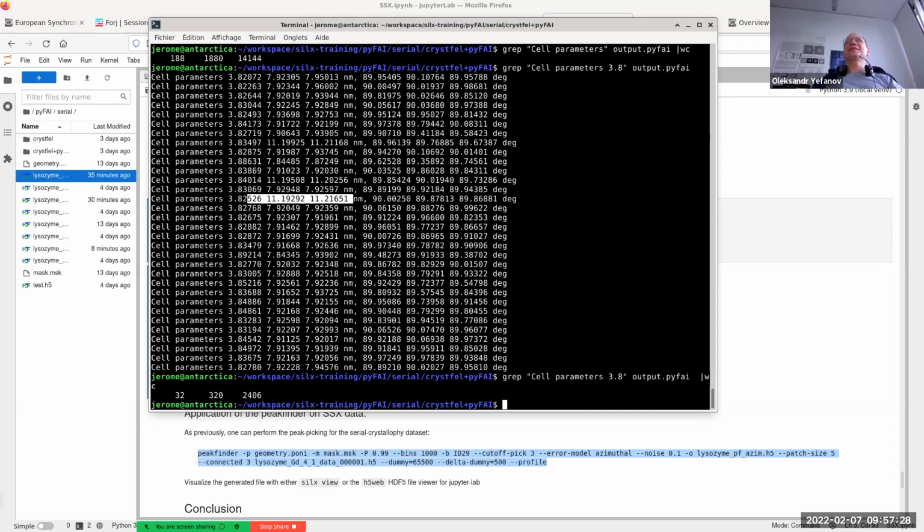May I comment on your results? Yes, please, because I'm playing with tools that I don't know, so you're the guru here.